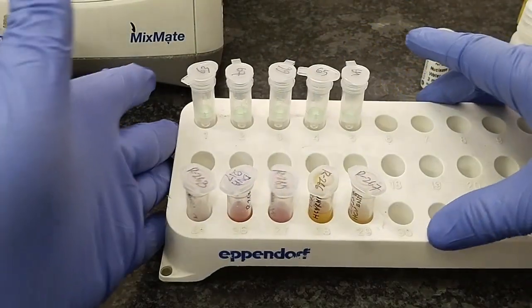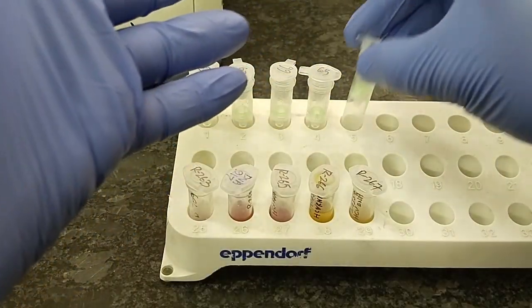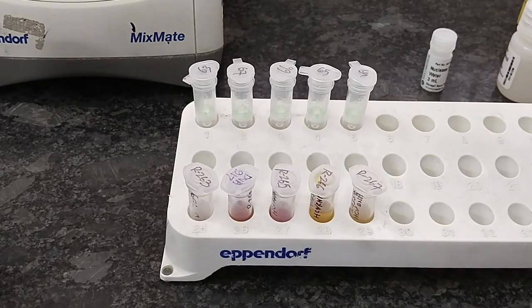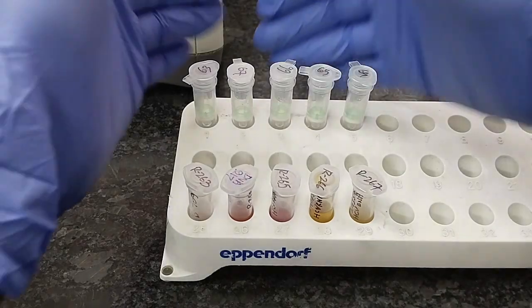The next step is dry spin. We need to centrifuge this column with the collection tube. No need to add any reagent, it is just subjected to dry spin. The speed of centrifugation is 12,000 rpm and the time is 30 seconds or 1 minute, as per the program in the centrifuge.